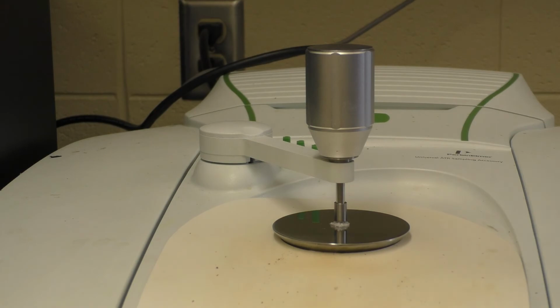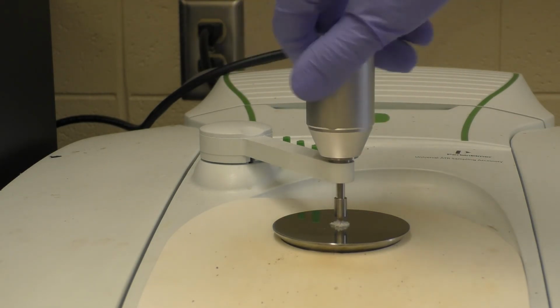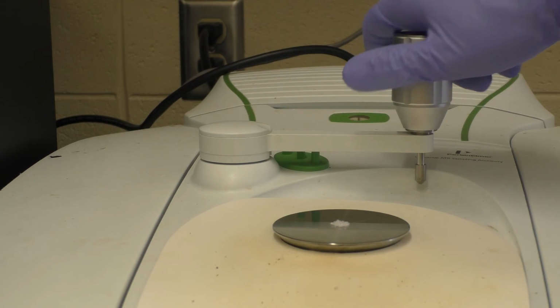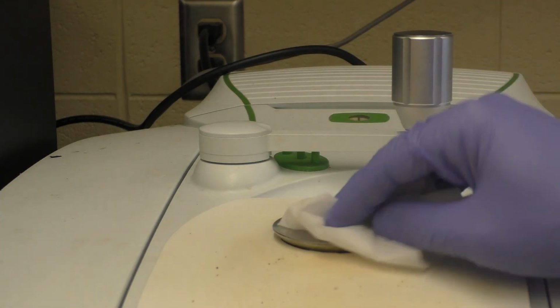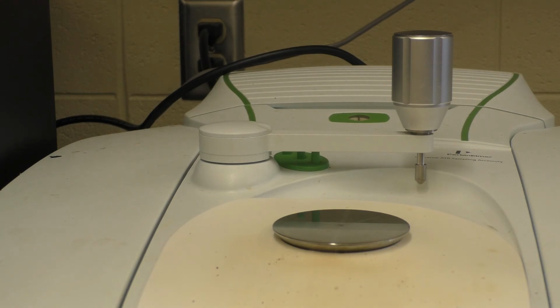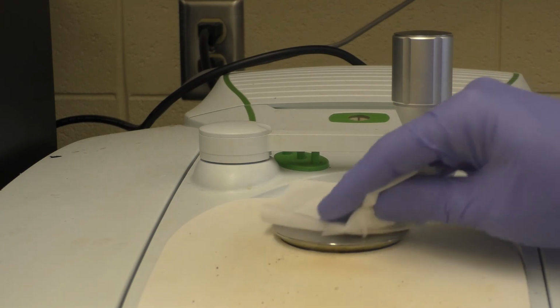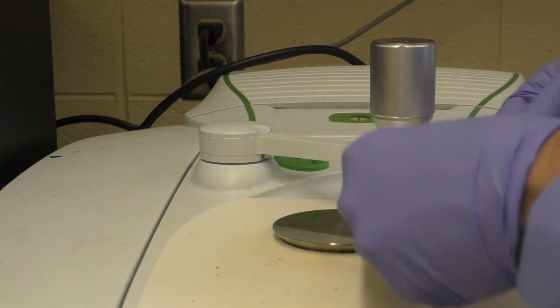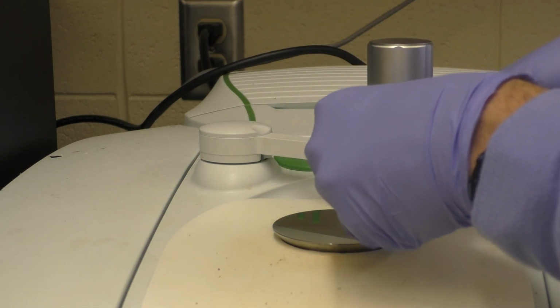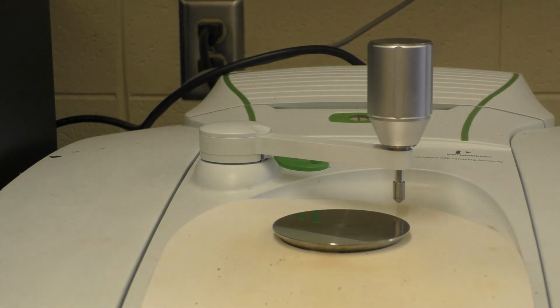Lastly, do not forget to unscrew the force gauge, slide it to the side, and then carefully clean off the sampling crystal using Kim wipes and acetone to carefully remove all sample. Remember also to clean the bottom of the force gauge with Kim wipes and acetone.